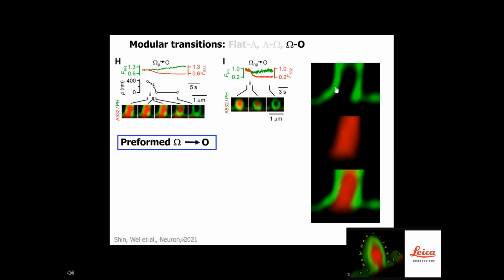We can see this better in this real-time video. It'll be really fast. This large pore is going to be closed after depolarization, and the red dye will then be bleached out to confirm that it's the pore closure. Show you here. It's open, closed, and then the red dye bleaches.